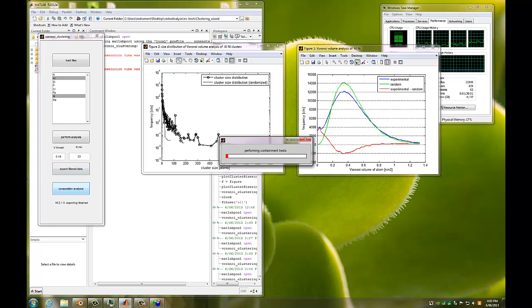And what it does is it calculates for each cluster which atoms are inside that cluster, and then it calculates the chemical composition of each cluster, and you get that back as a .csv file, which is really great for analysis, for example, in Excel. This will take a minute or two, and I'll pause the recording again at this point.